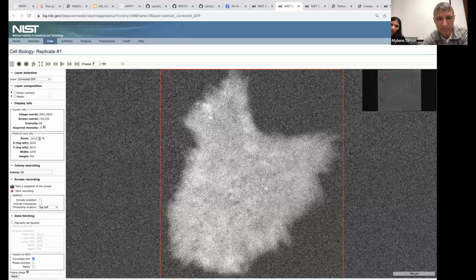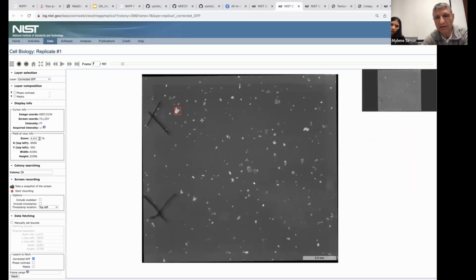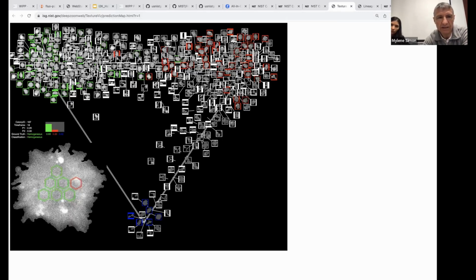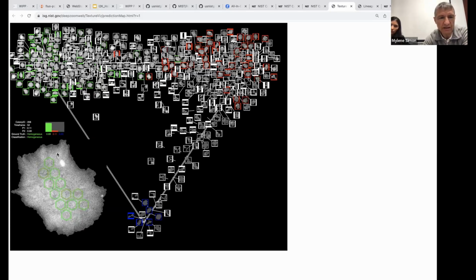As I mentioned in the PowerPoint slides, the end goal was to really characterize each replica as a whole, and for that we have created these visualizations where you can see each colony is classified based on the homogeneity of the OCT4 channel, which means we tile more or less the colony, and then decide whether it's homogeneous or heterogeneous.